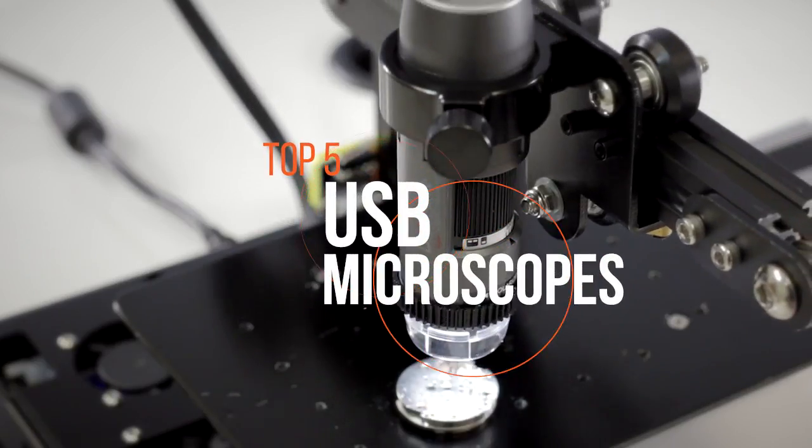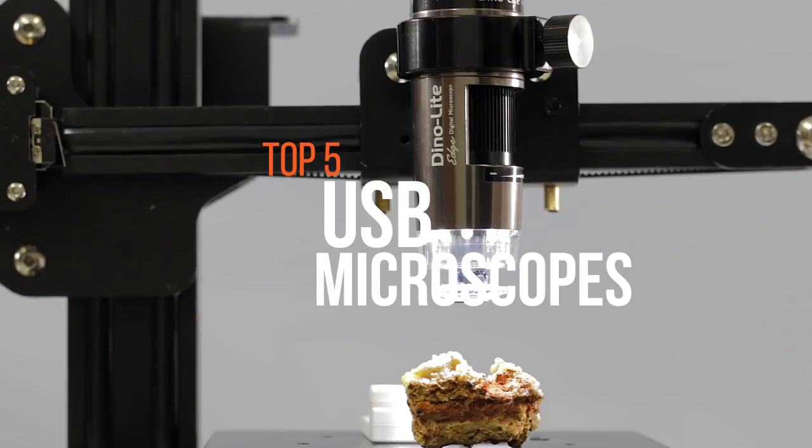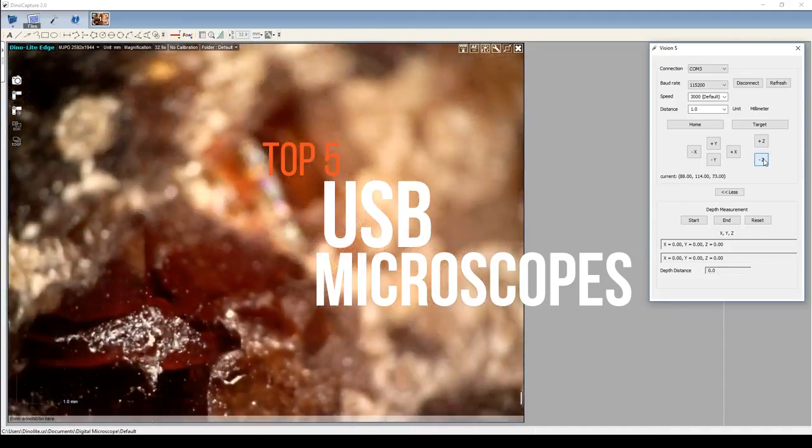Are you confused on which is the best USB microscope? Then take a look at this video to decide the one to buy as per your needs.